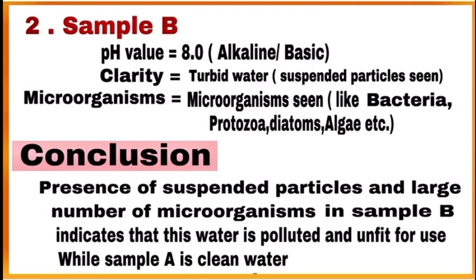So, what is the conclusion? Presence of suspended particles and a large number of microorganisms in sample B indicates that water is polluted and unfit for use, while sample A is clean water.